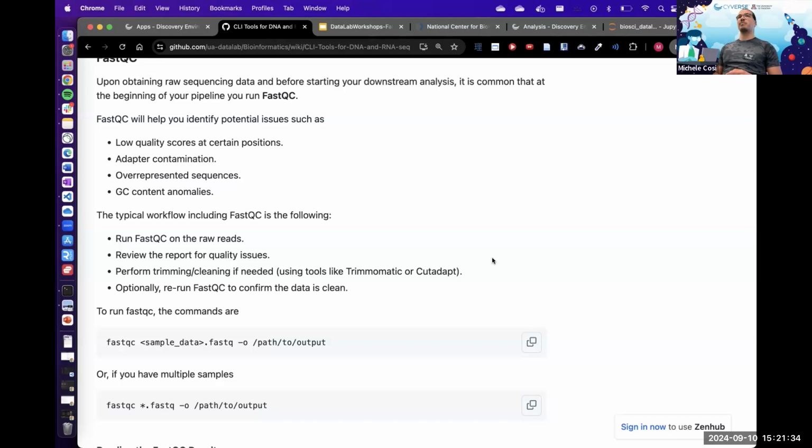Well, the alignment process will take a while, and these are contaminated. Right, exactly. So literally, as soon as your data comes in, the first thing you want to do is check all of your data, make sure that there is no contamination, make sure that this data makes sense. I'm not going to talk about trimming your data today, but you might see some contamination, and therefore you might want to trim some areas first before you carry on with assembly itself.